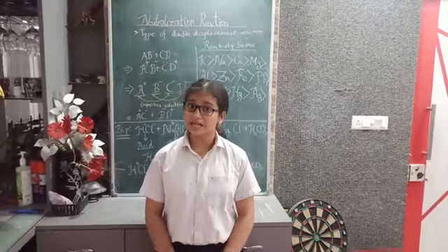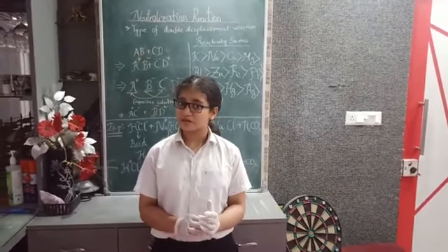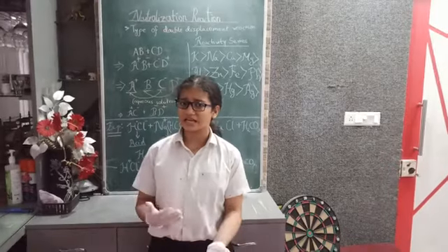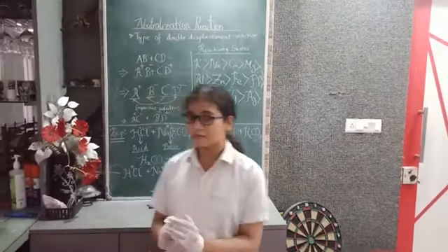But before any chemistry experiment, we must always wear a pair of gloves because some chemicals may affect our skin. So always remember to wear a pair of gloves.